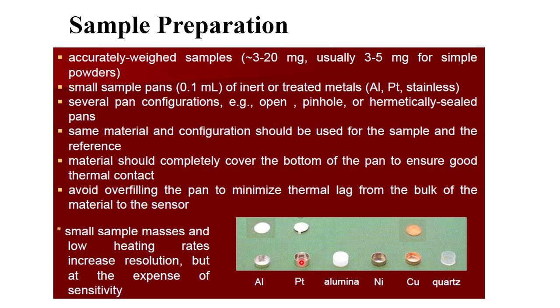And it is important to do the test under a low heating rate. So if someone is doing the test at 5 degrees centigrade per minute and the same material is tested at 20 degrees centigrade per minute, there will be a slight difference in the data.